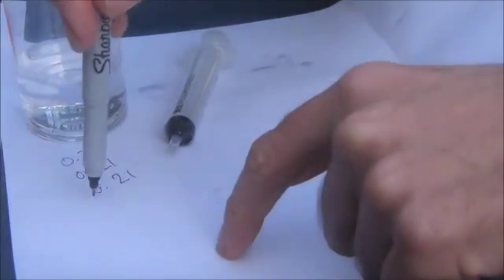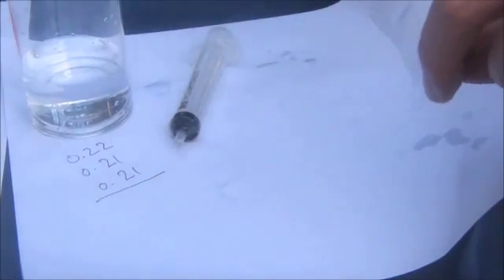If you use the AquaMerc kit, we're not using that, but if you use the AquaMerc kit, it's simple, because the acid syringe is already calibrated in terms of milliequivalents of alkalinity in the solution. So if you'd done the titration with the AquaMerc kit, you'd have been able to read off from the syringe directly how many milliequivalents of bicarbonate there are in the solution. HANA don't make it quite as simple for you. They simply allow you to read off the acid amount in millilitres.